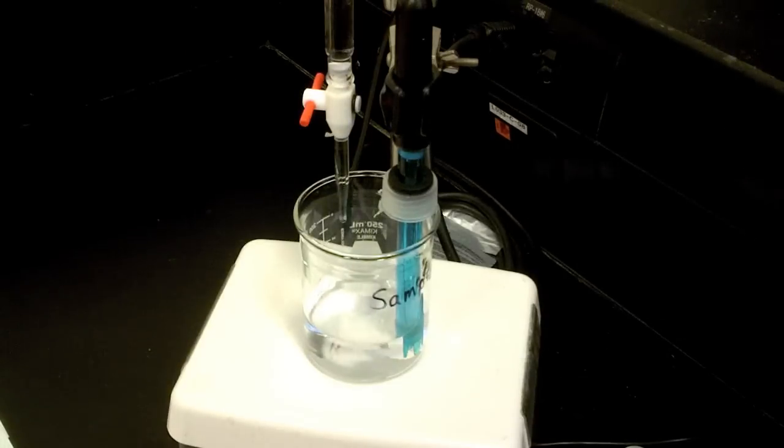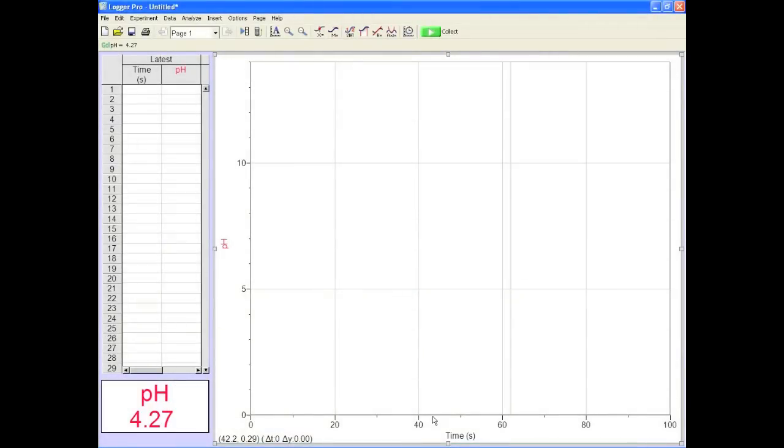Not too much though, that's not gonna work. pH probes don't take kindly to excessive vortexes, splashing and air bubbles.